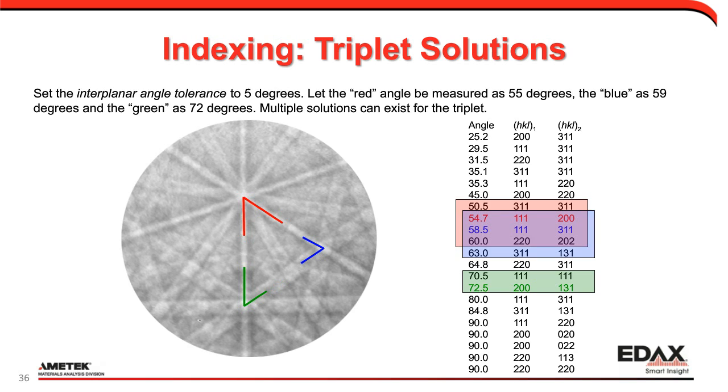Now, when we do this, of course, we don't expect our band detection to be perfect in terms of the line positioning either. We have some tolerance to how well we find the band. And so in this particular slide, we put down 5 degrees, so it kind of shows a window of opportunity. Generally, we run at 3 degrees as a default tolerance. But I emphasize this because what it means is that for a given triplet, we may find more than one possible match based on this tolerance. And so that allows us to sample more of what we call votes.